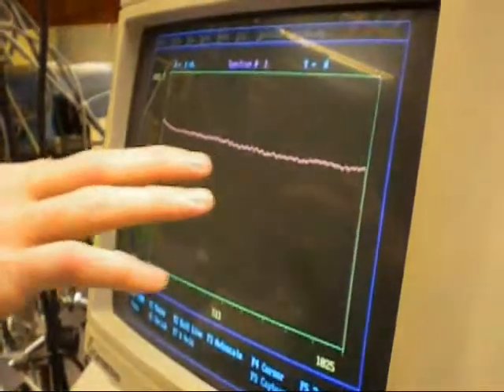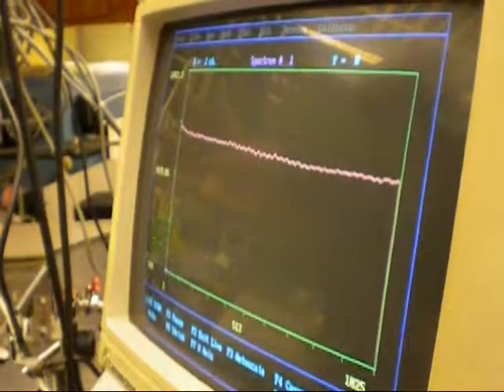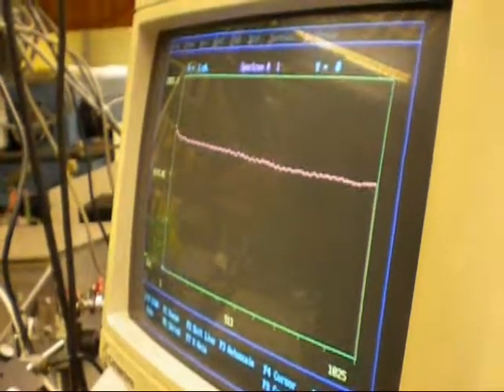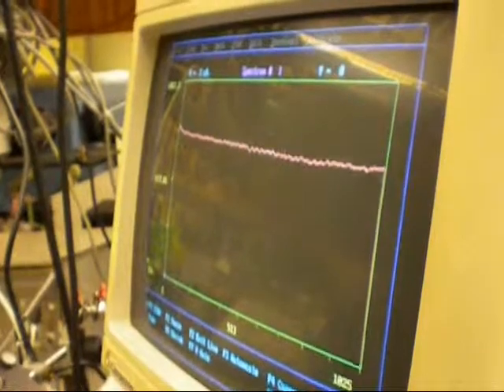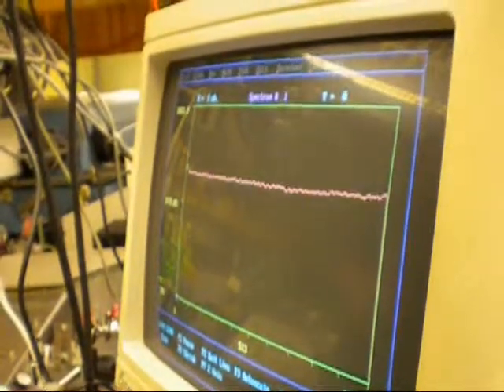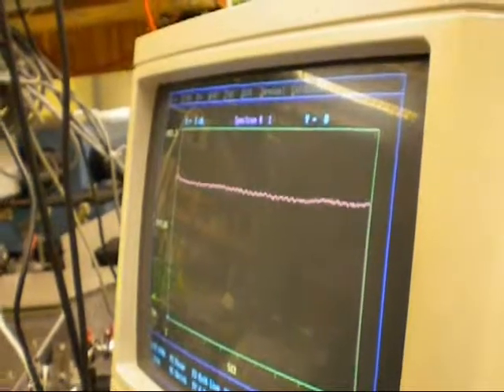And so this is the broad output now, from this laser, when imaged, when directed into that monochromator, and then onto the diode array. And then by playing with this thing here, I can move that display across as we need, so as to see absorbance by something.